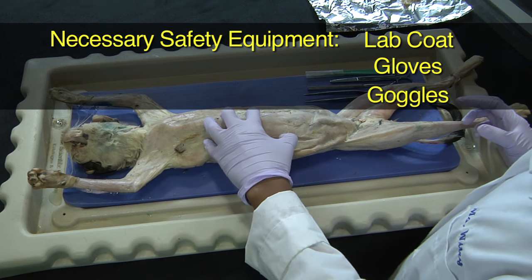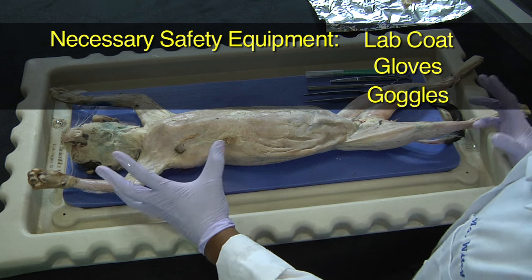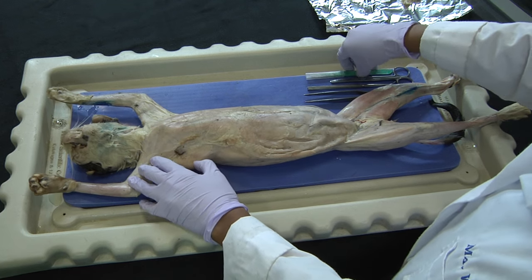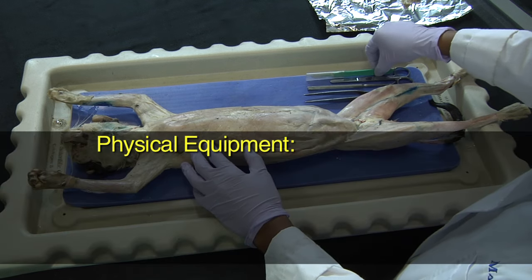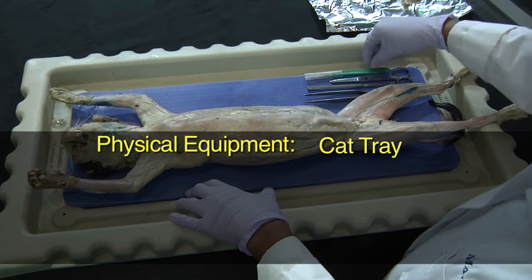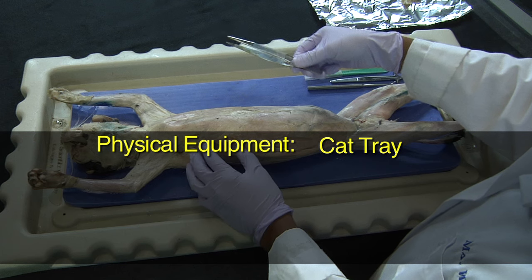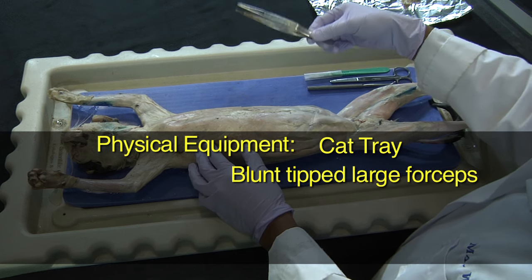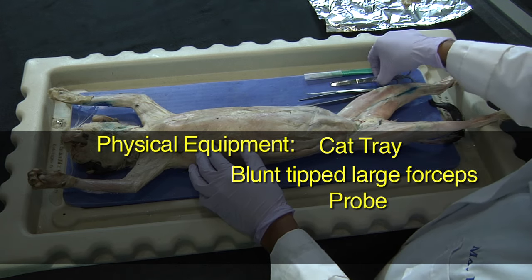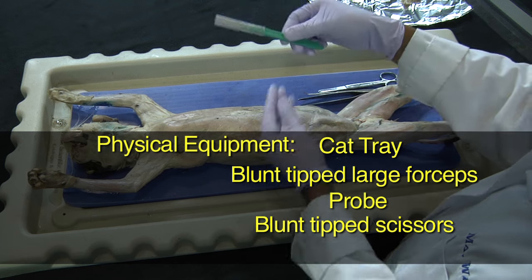The fixative used to preserve these cats is toxic, so having a ventilated area along with eye protection and skin protection is very important. In terms of physical equipment, there is the cat tray where the cat will be laying, blunt-tipped large forceps, a probe, blunt-tipped scissors, and a scalpel.